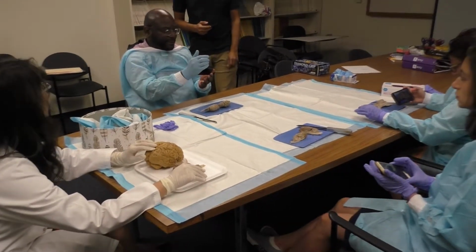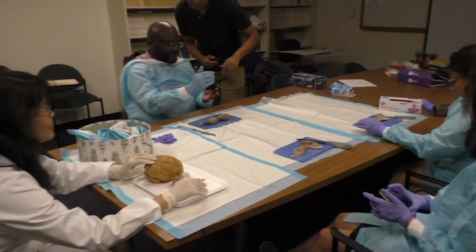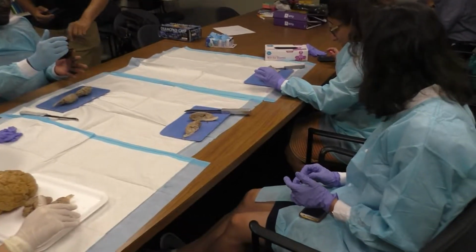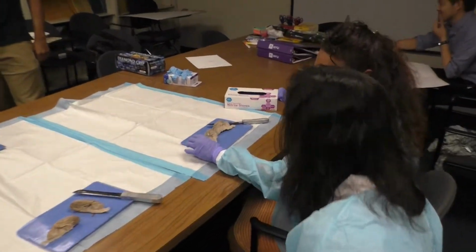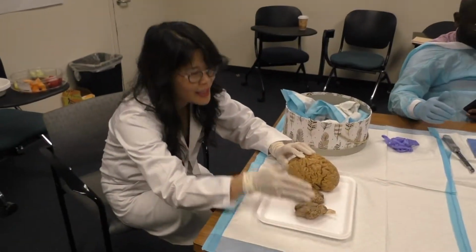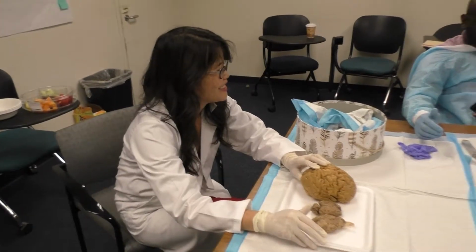You could hit that. You're right there. I think there's a chance I did not cut right smack down the middle because my incisions were slightly different. That's fine. It was no problem yesterday. It's going to be even better. So we can see certain things in the center one, and there are slightly different views from the next side around.